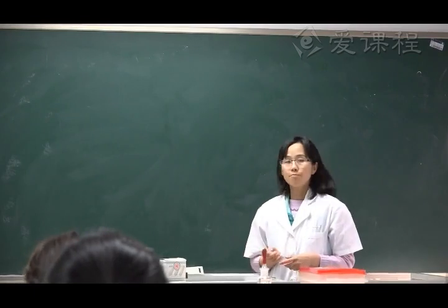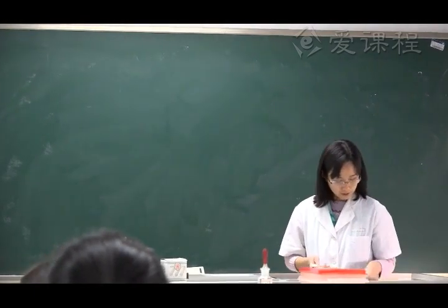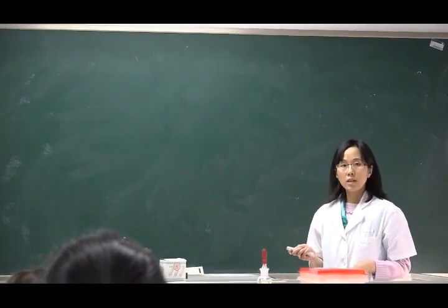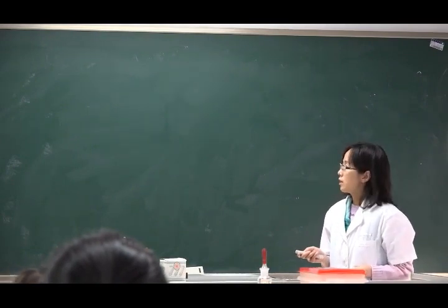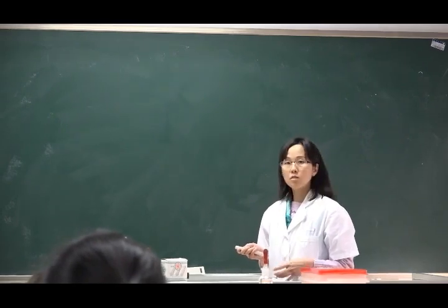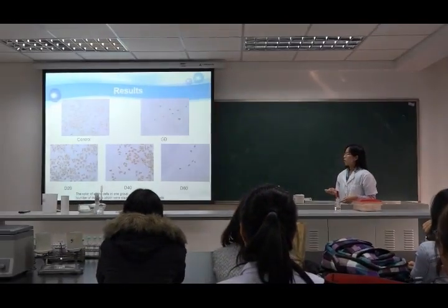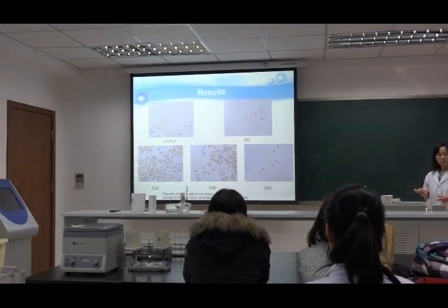And one of your students has explained this very well. He said we need to do some additional experiments. And here I want to mention one thing. That is, the color doesn't represent the apoptosis. We can only make sure the cell underwent apoptosis through the morphology change.